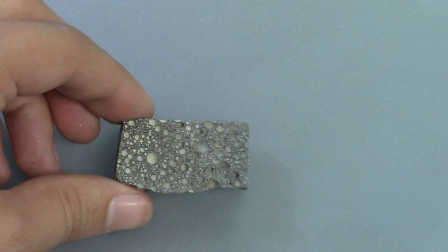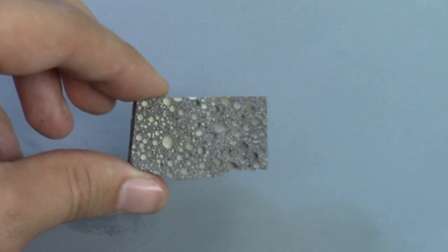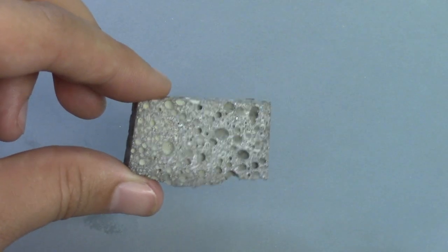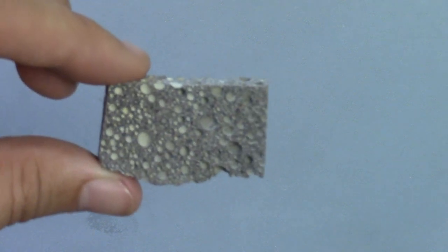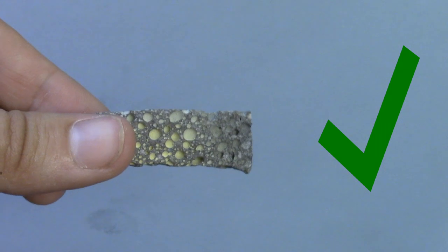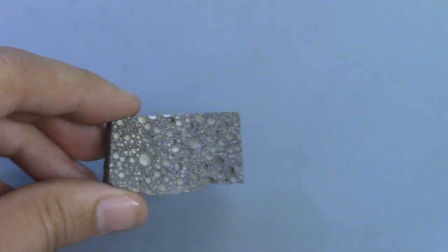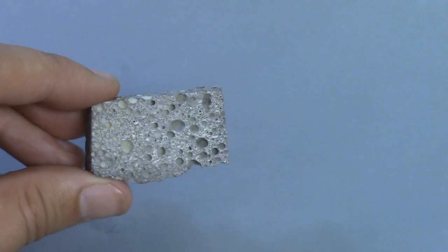This one we're about to show you is a basalt, a vesicular basalt which means it has holes in it naturally. It has vesicles. The surface that's flat has been polished pretty well. It's very reflective but of course the holes or vesicles aren't reflective themselves because they're cavities and you can't reach the polish inside of the holes. So that's okay.